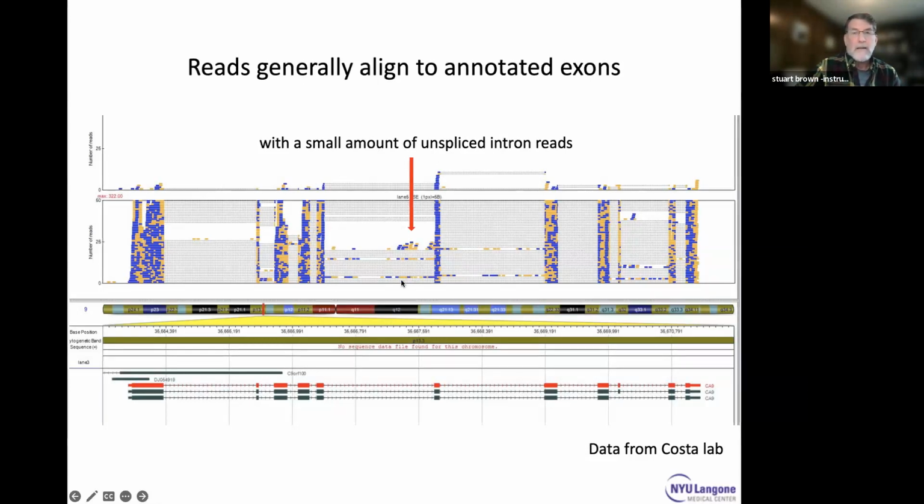If it's not stranded, you might get reads coming from transcription happening on the other strand. It's also possible to get a small amount of DNA contamination in your RNA-seq reads, which may show up as reads that map inside of introns.